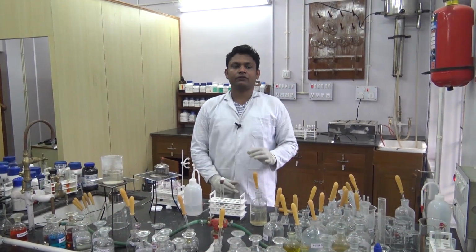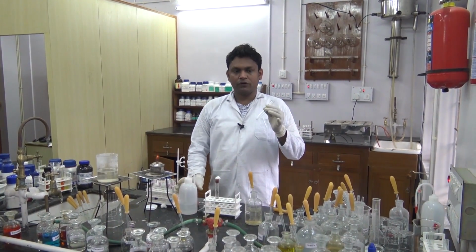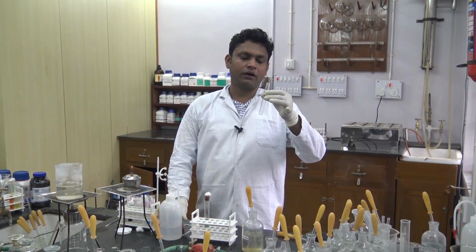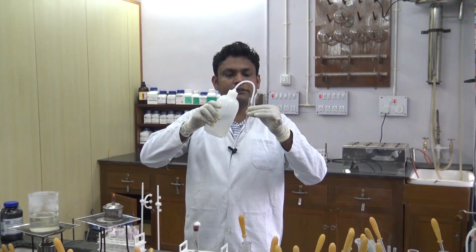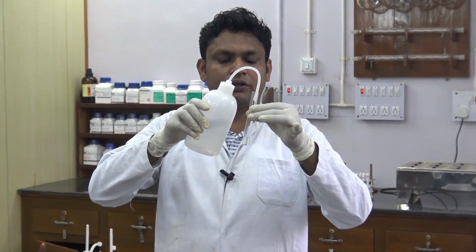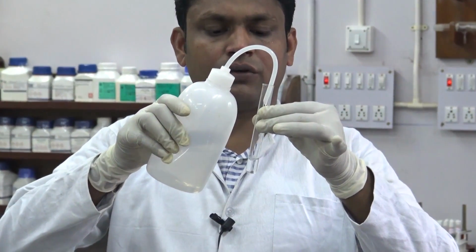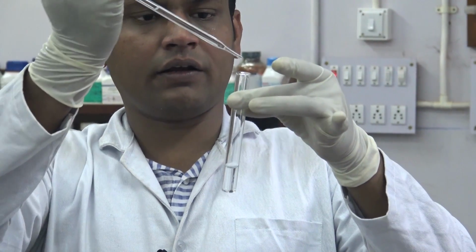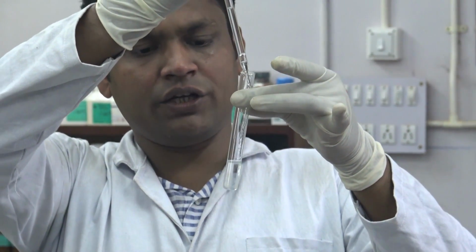Now we go for the test of zinc ion, that is the confirmatory test by hydrogen sulfide reaction. For this reaction we take the sample and dissolve it in distilled water. After dissolving the sample in distilled water, we will add NaOH to it.